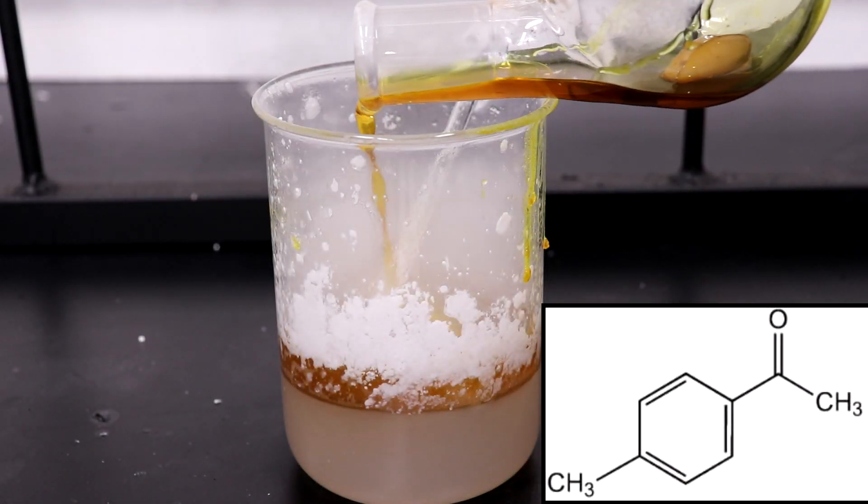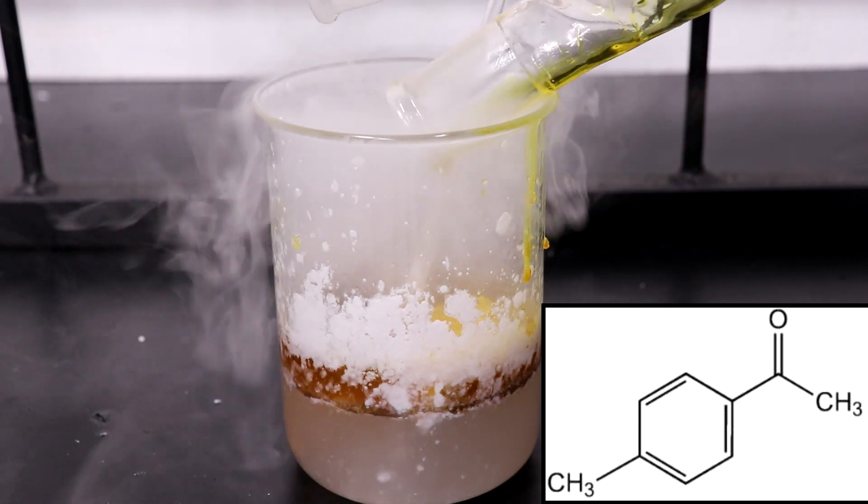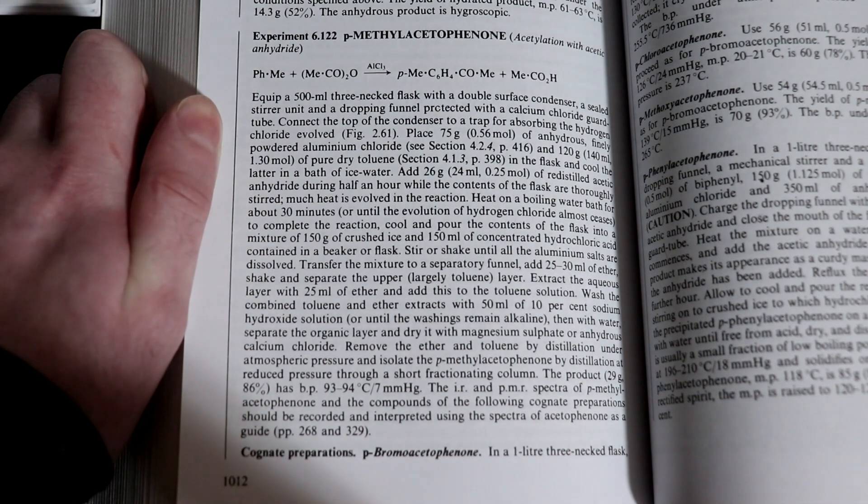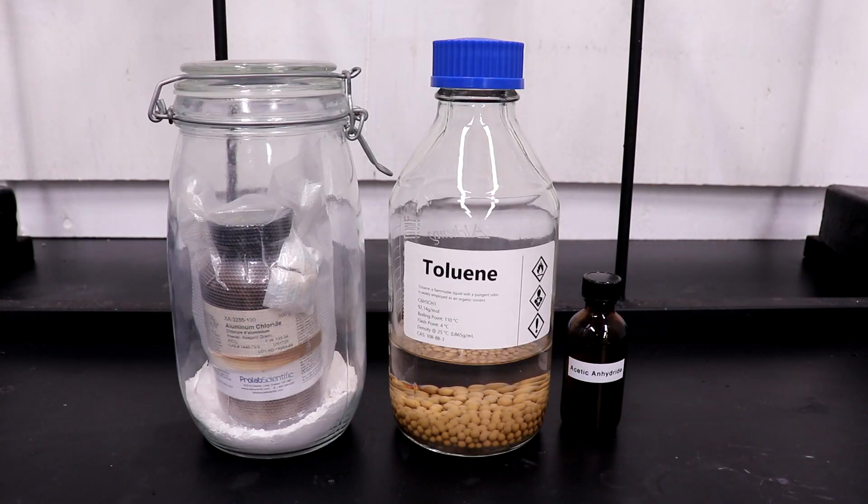Today, we are going to be running the Friedel-Crafts acylation of toluene with acetic anhydride to produce P-methylacetophenone, following the prep listed in Vogel. I ran the procedure at half scale using 37.5 grams of anhydrous aluminum chloride, 70 mL of toluene, and 13 grams of acetic anhydride.